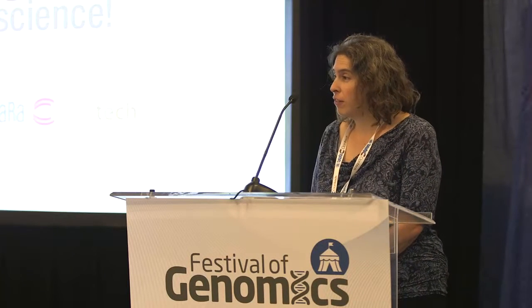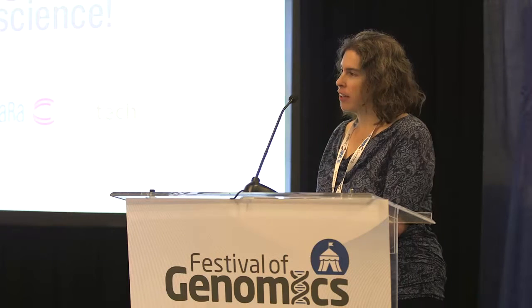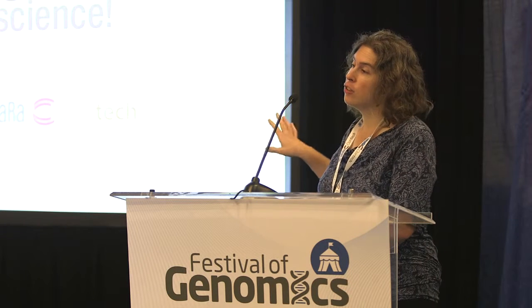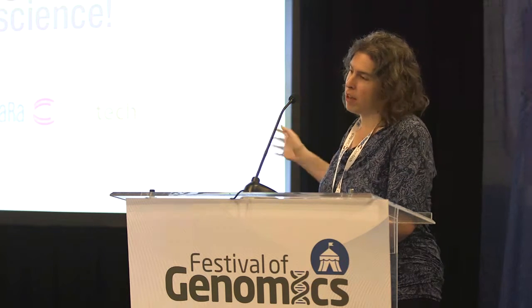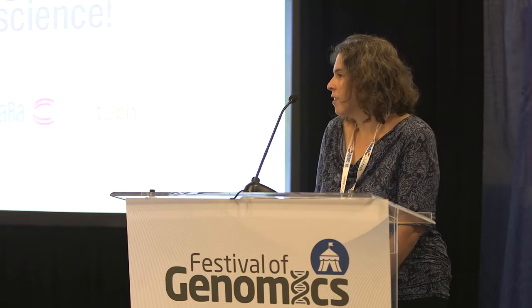Well, thank you for the question. So I'll say upfront, I am not a bioinformaticist. We recently did get a little more bioinformatics help, but most of these data that you've seen were actually generated with a different software platform called CLC Bio.